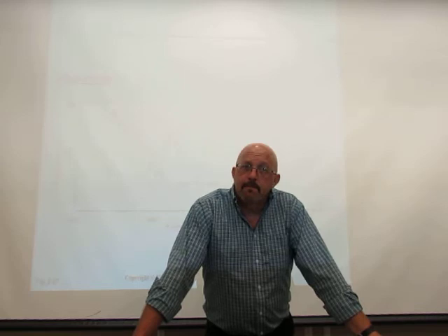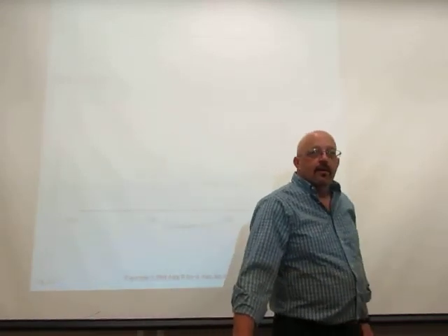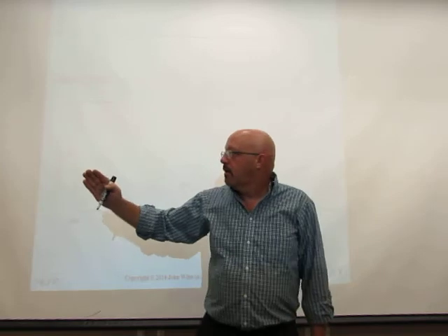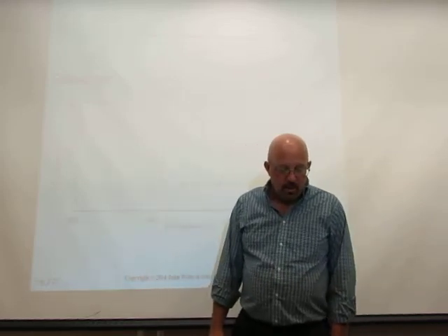Why? What is different about a carboxylic acid? Let's put up the general formula for a carboxylic acid. So why is that OH so much lower than an alcohol OH stretch? Resonance. That OH has resonance into the carbonyl. Resonance lowers your frequency. We've talked about that. So it's a lot lower than an alcohol OH because the carboxylic OH has the resonance with the carbonyl.